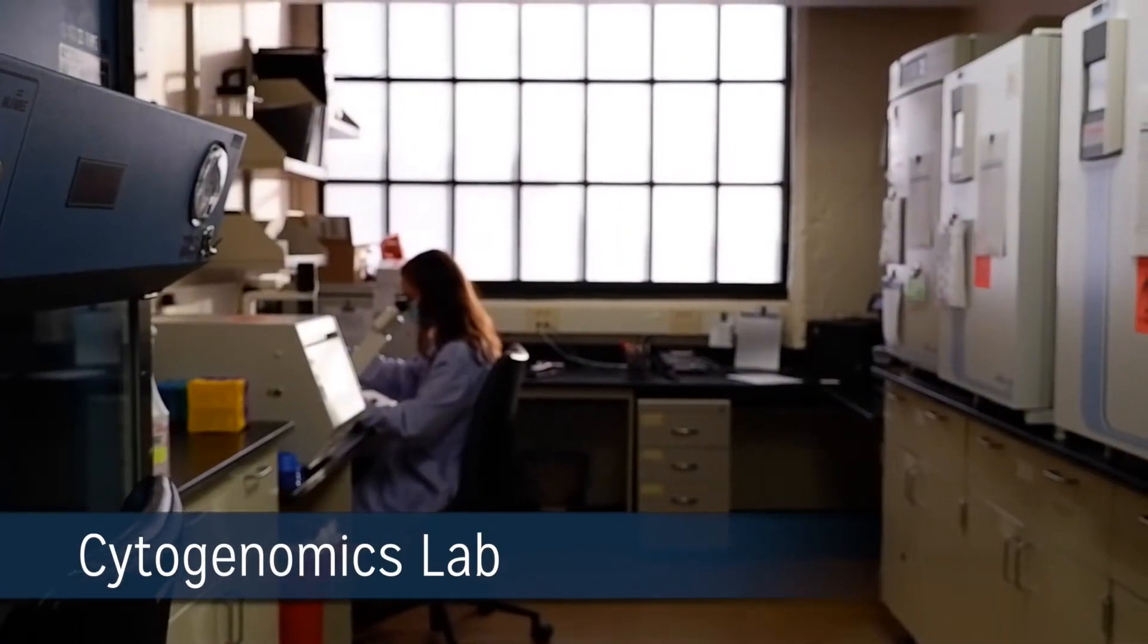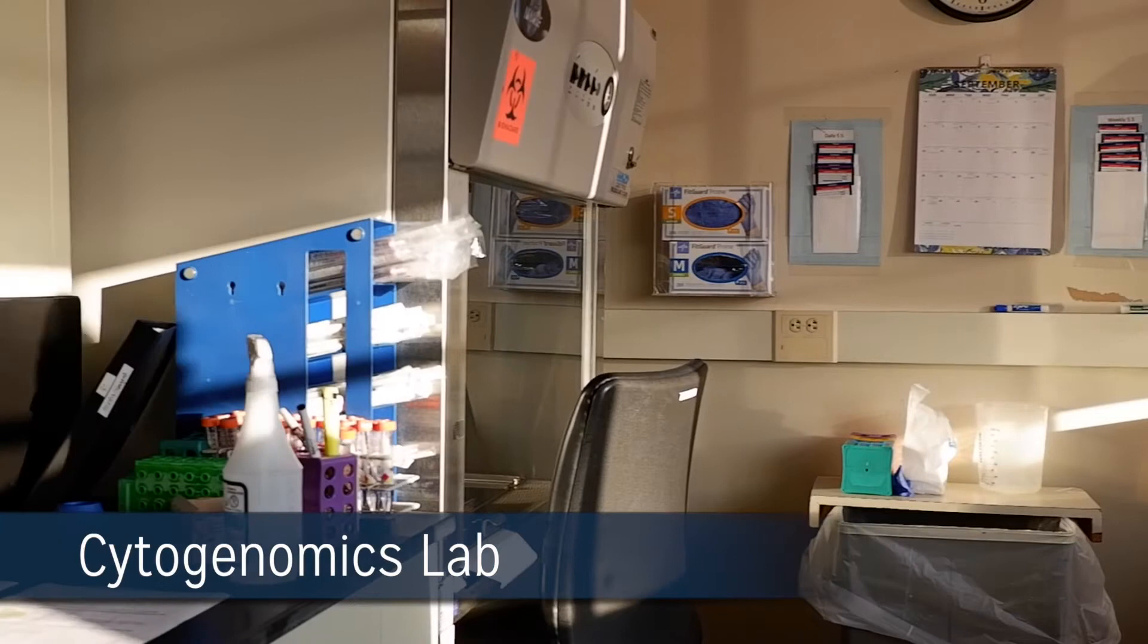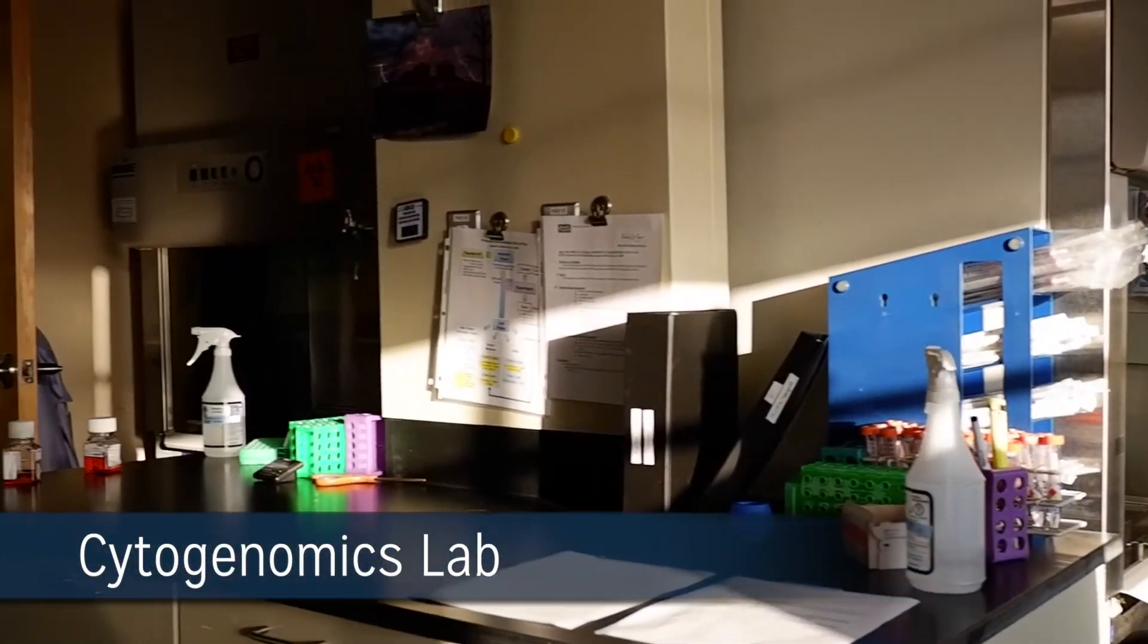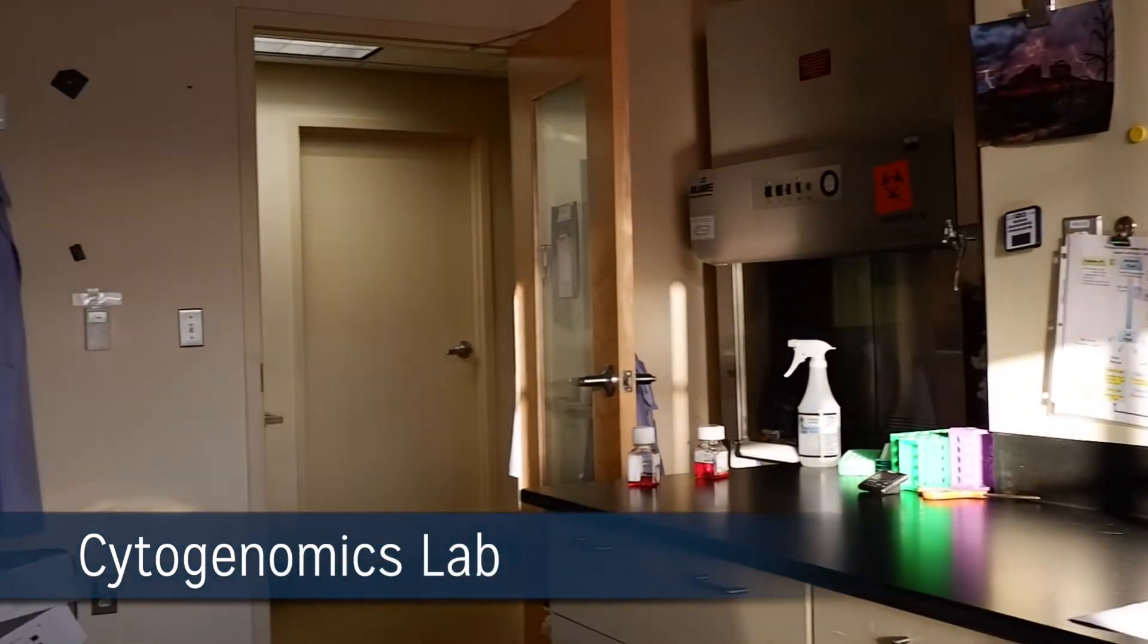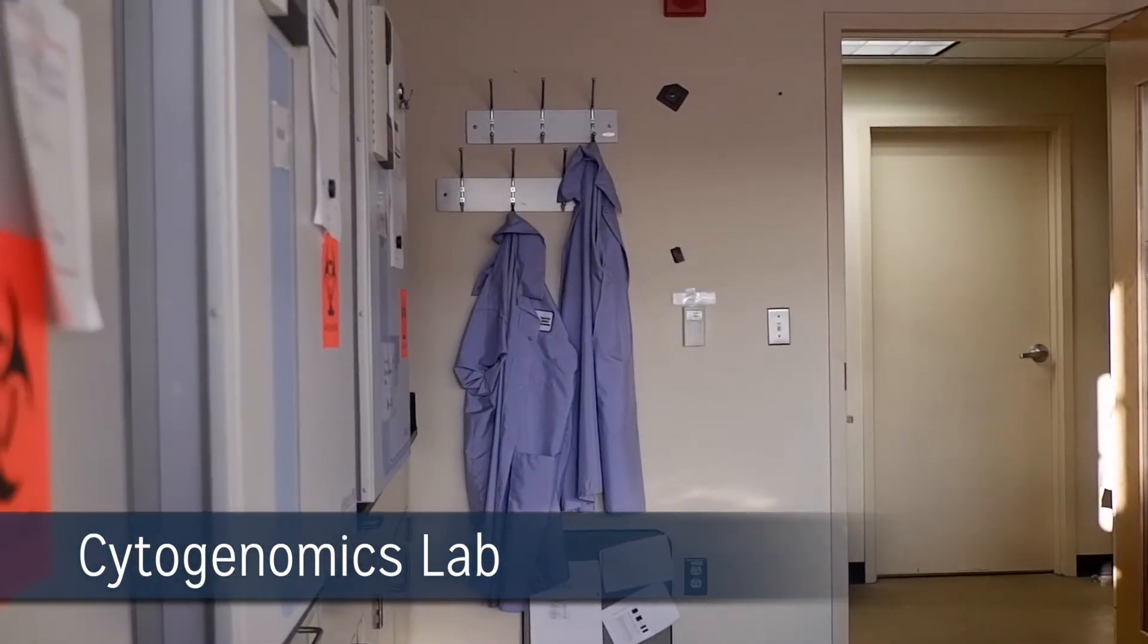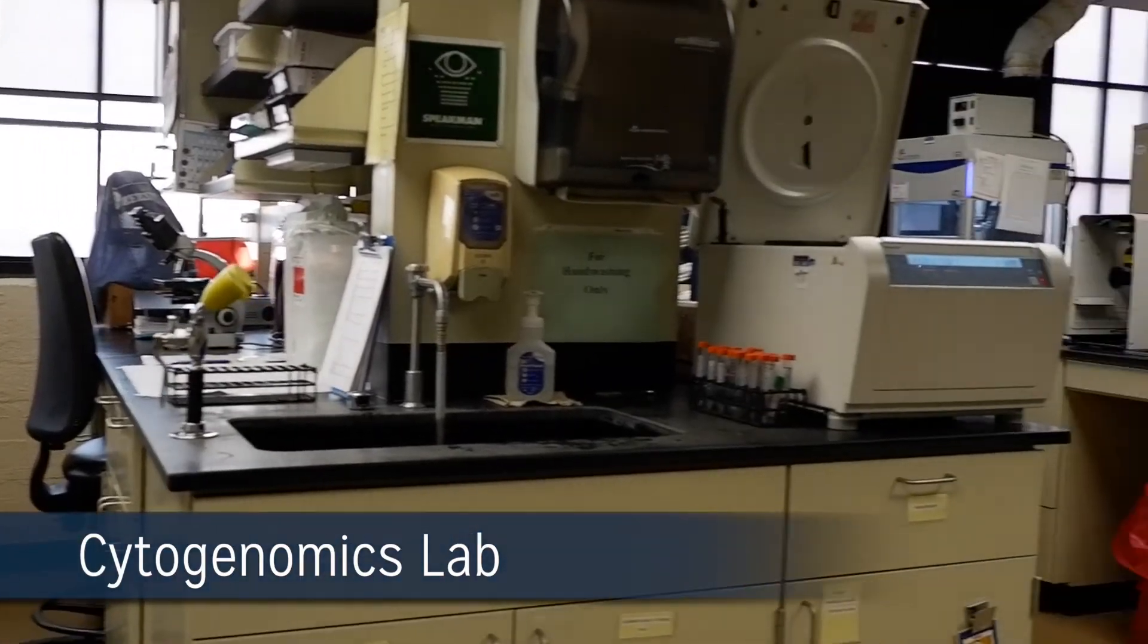The wet laboratory consists of long- and short-term tissue culturing techniques. Oncology samples include bone marrow, leukemic blood, and tumors, while constitutional samples include peripheral blood, amniotic fluid, chorionic villi, and tissues.